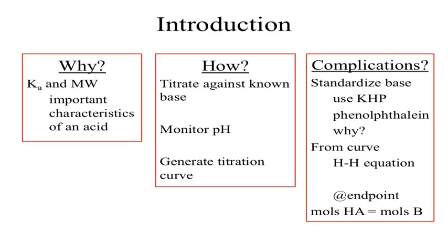So how do we end up doing it? To start off with, we want to test its reactivity. If it's an acid, what do acids react with? Bases. So what are we going to do? We're going to add base, and we're going to monitor how it reacts with that base through the course of some arbitrary measurement. In this case, we're going to monitor how it responds to that base with respect to pH. So how does our weak acid respond to the controlled addition of base? That's going to have to happen through a titration, or a pH titration.